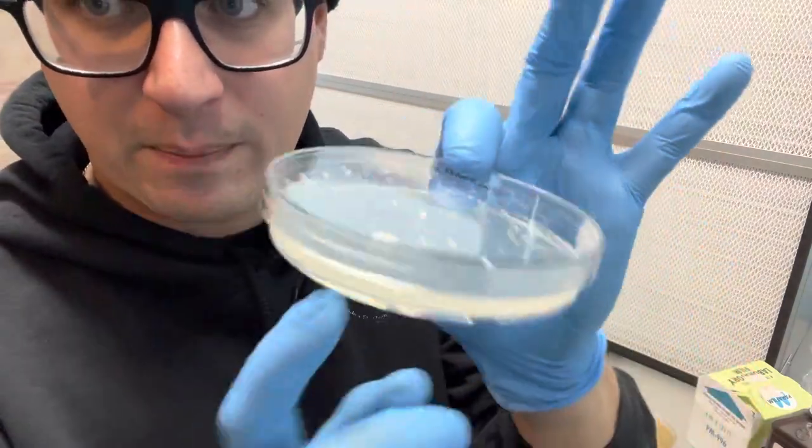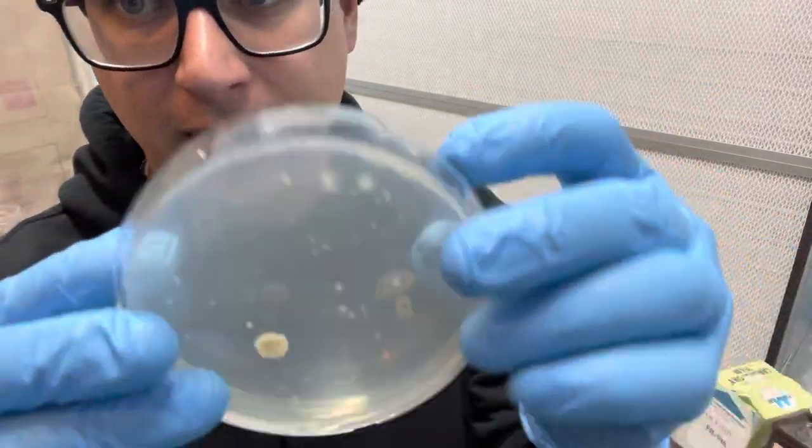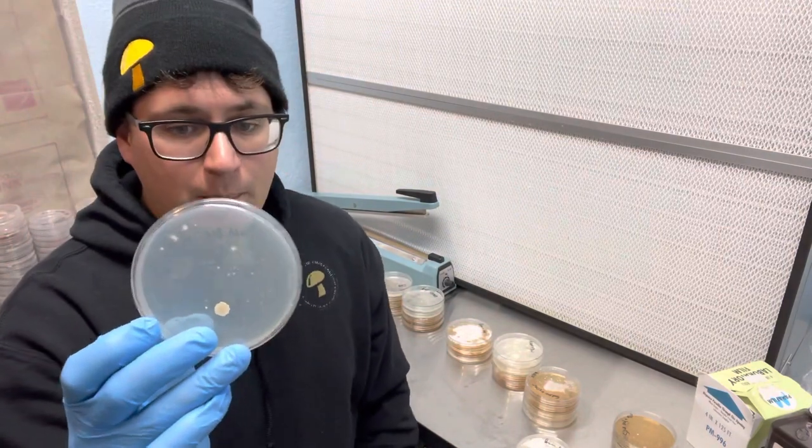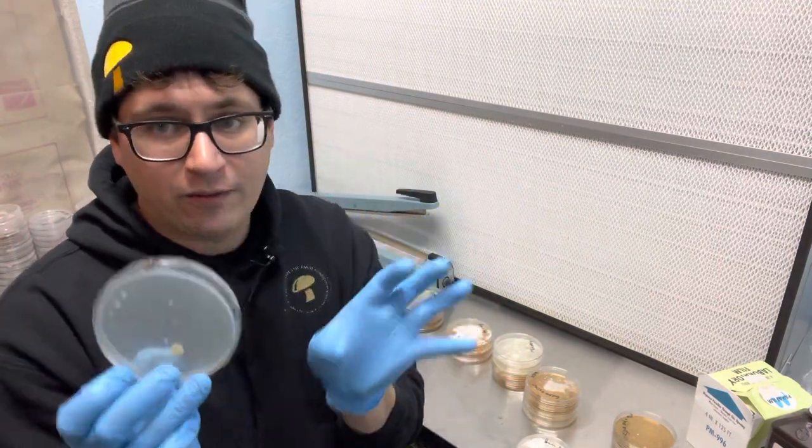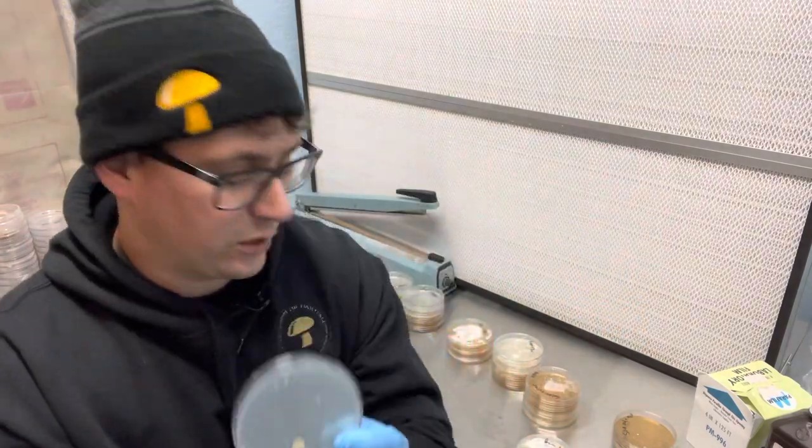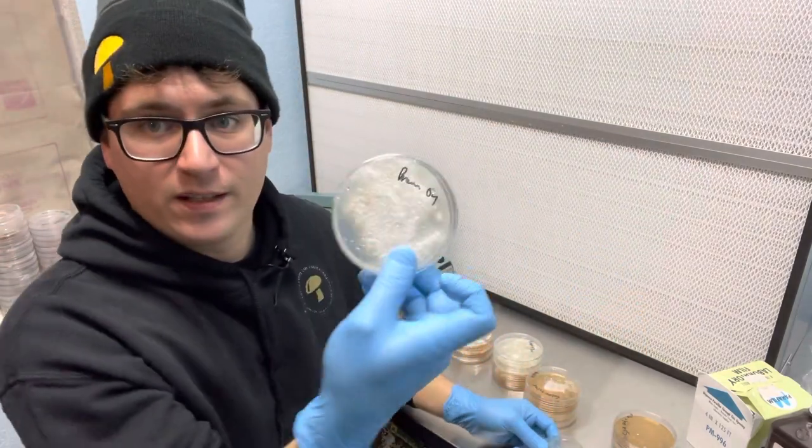These spores had just appeared about eight hours prior, so it took about 14 days for these spores to germinate. But in about a week from now, all of that mushroom mycelium is going to overtake this petri dish, just like this brown oyster here.